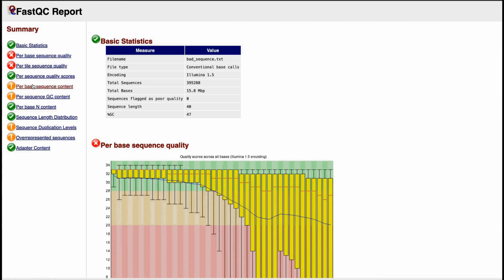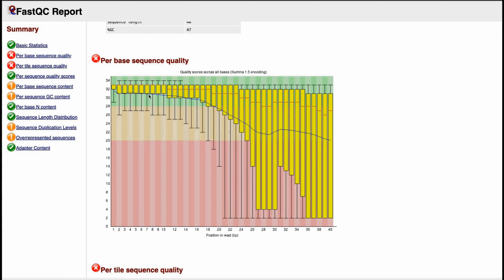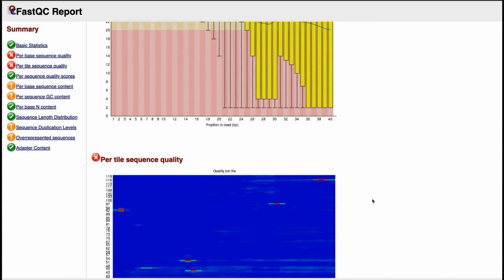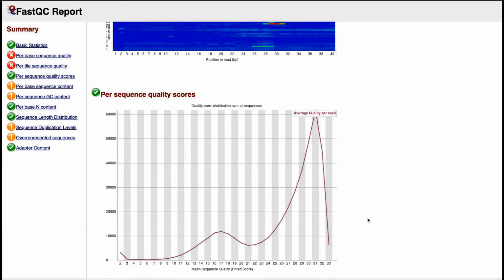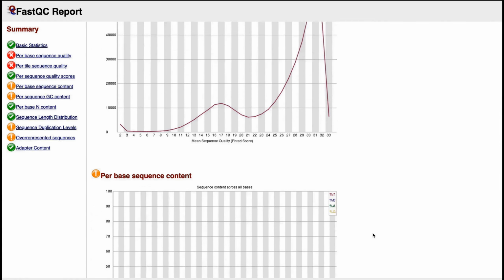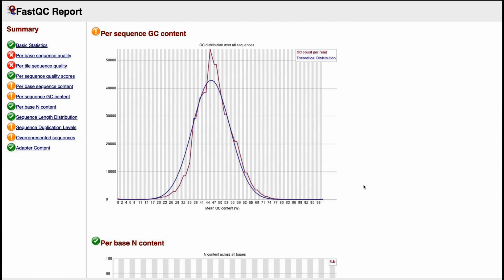And of course, if you take a bad case scenario, then you see that the quality can decline dramatically and the Phred score is so poor that there is no way of using it. And there are massive scratches on the glass which have to be fixed, and there are way too many sequences of poor quality, and the GC content and all bases are wobbling all around.